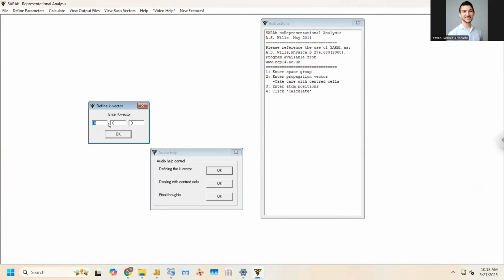Of course, there are cases where that's not the case, but in general, say you have a compound that you measured and you don't know what the magnetic structure is, so you sent it off for neutron diffraction and came back with some magnetic peaks. I think the first thing to try is a q equals 0 order. If it looks like none of the q equals 0 orders work, that's when you set up a meeting with Steven and ask what to do. Luckily, I've never had to run into anything more complicated than q equals 0 so far. So this works most of the time.